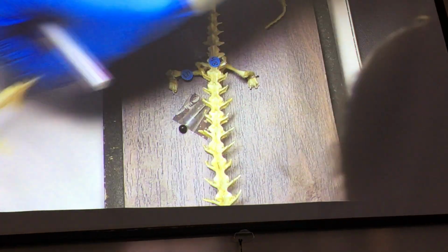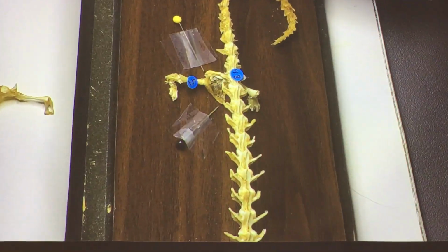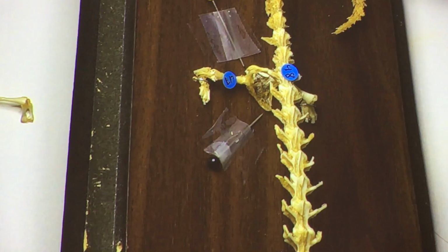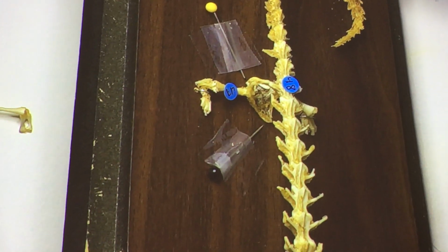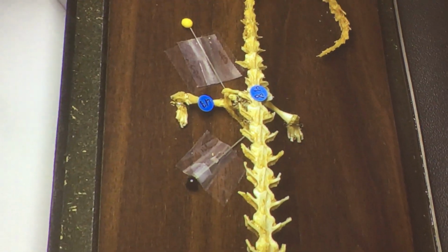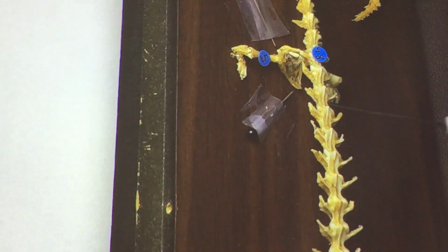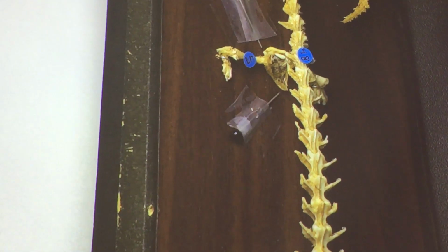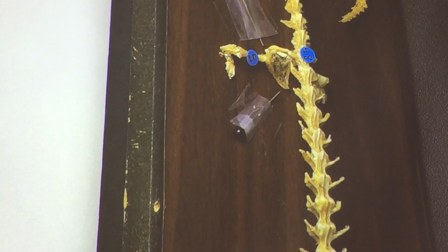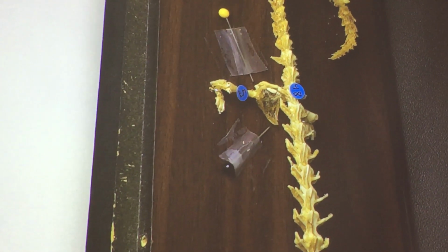And I'll put our little pectoral girdle here as well, pointing the same way. So, this is going to be shaped different than your pelvis is. Okay, not surprising. But just like I said before with the kitty cat, the cartilage pointing to the front, pubis, right? Because the male is led around by his pubic region. Remember how I said you sit on your ischium? The ischium on the mud puppy looks like a pair of butt cheeks with a cartilage thong. Makes it really easy to remember.